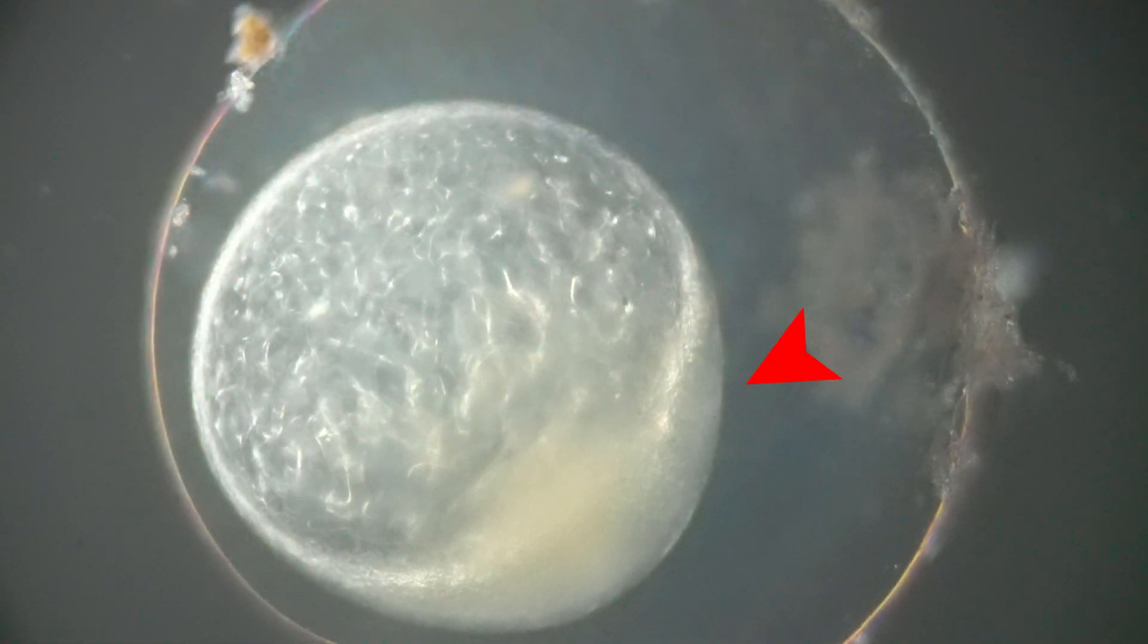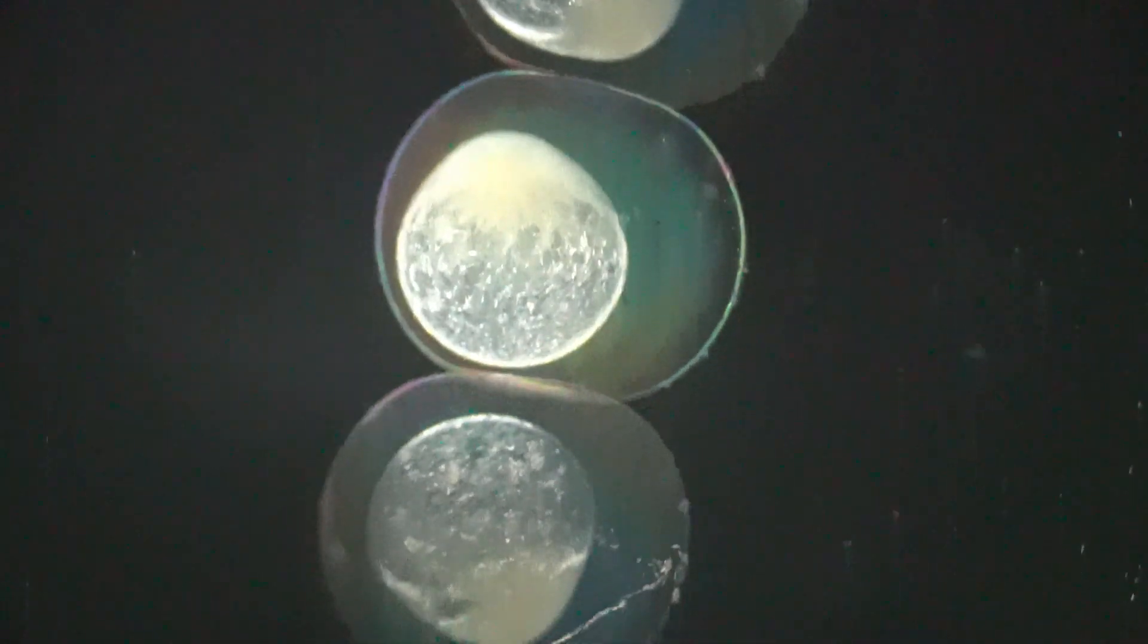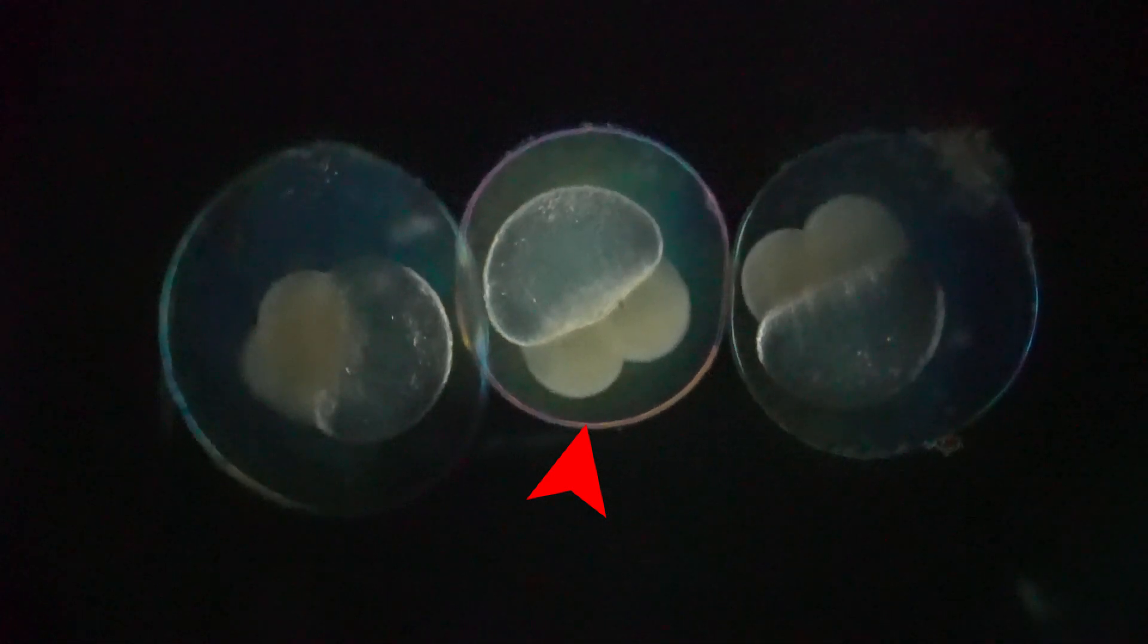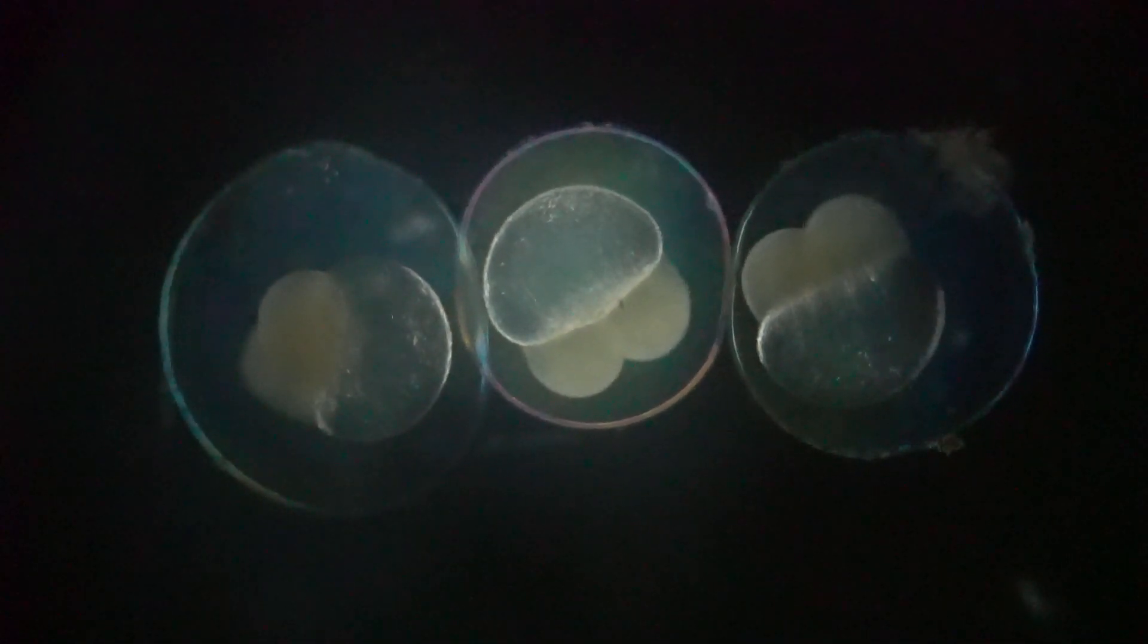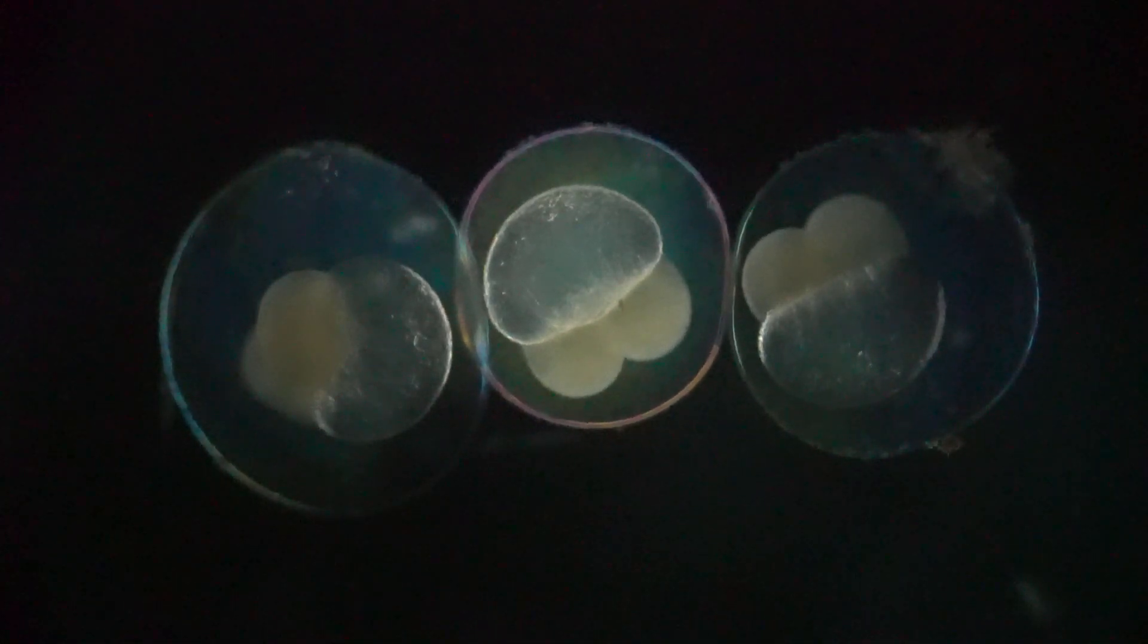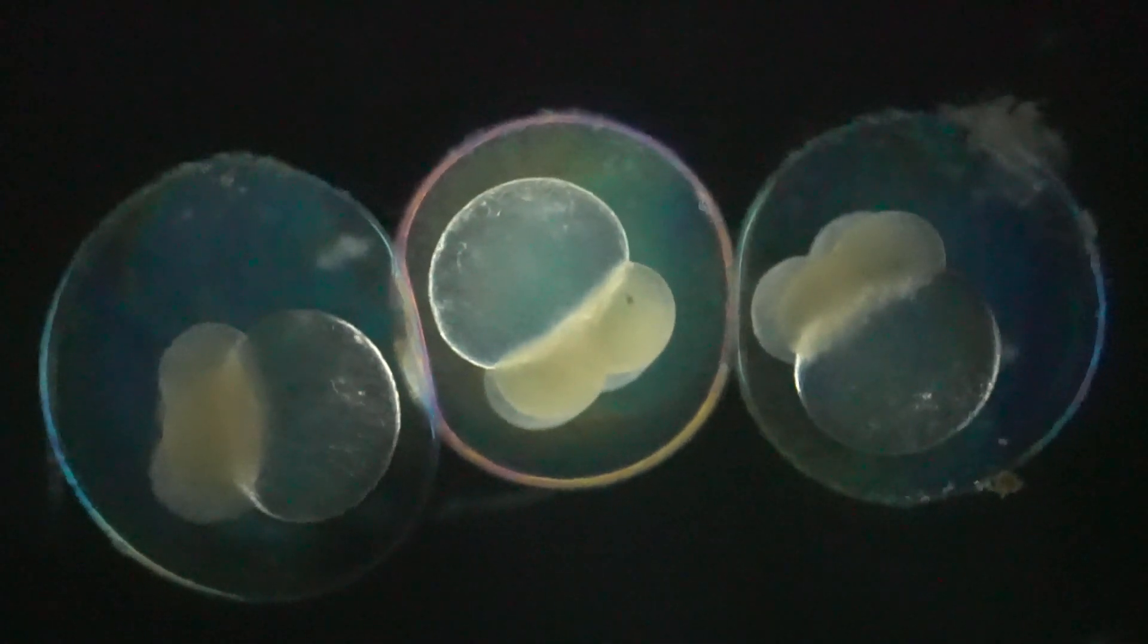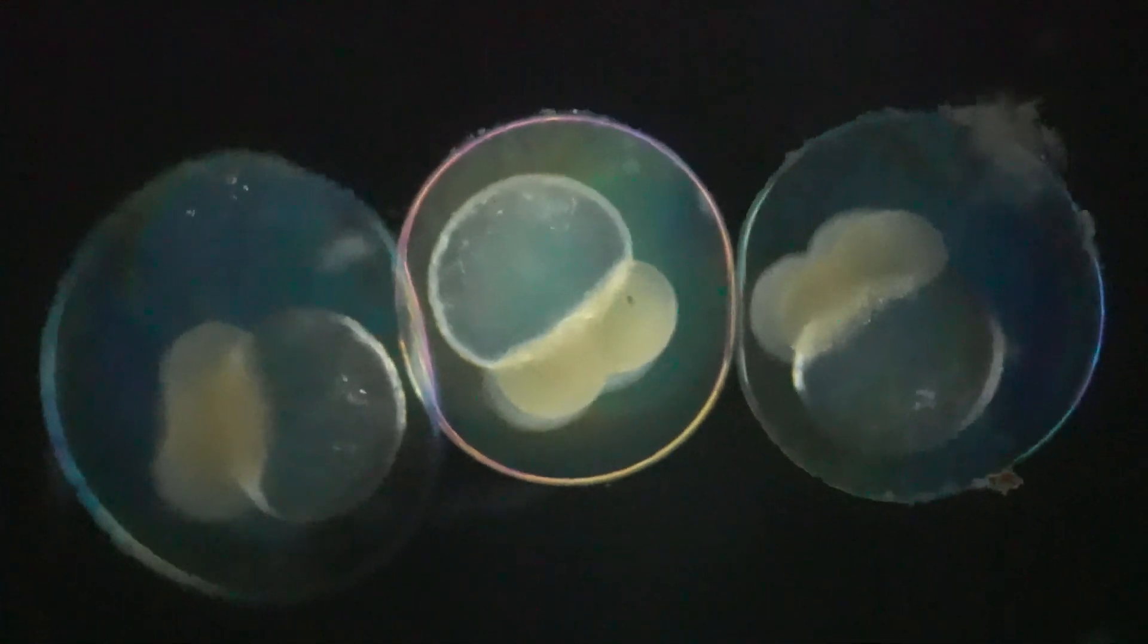Now this blastodisc is really just one cell which starts to divide into two cells. You can see that that blastodisc has developed into two cells. Now these two cells will divide into four cells within minutes. It's really awesome to see these cells dividing right in front of your eye.